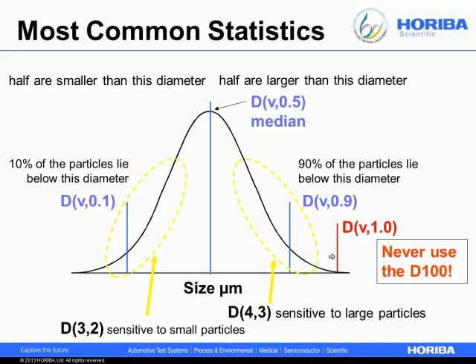you'll see a lot of variation. You'll see very poor precision on D95, D99, and especially D100, because there's so few particles that unless you get the exact same sampling and dispersion, what you may think of as a poor product being passed is actually a sampling or dispersion error. So we prefer to recommend nothing larger than the D90 simply because this is a much more stable metric, and it's much less sensitive to how the sample is prepared or how the operator introduces the sample. So if you see the D90 truly shift, you can put a lot more confidence in the fact that it's because the product itself is changing, or the process that creates the product.